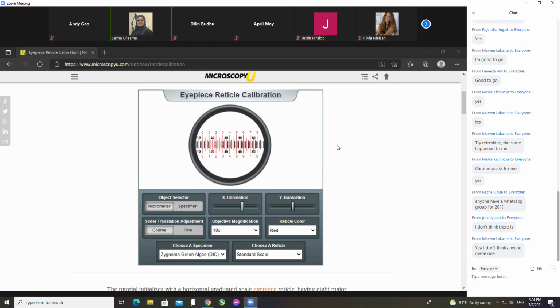So let's first do that. Let's first figure out by matching them up on one end. Let's start with the 0 end. Match up the entire ocular ruler, which is red, with the stage micrometer divisions. Okay, let's do that first, for the objectives 10, 40, and 100.